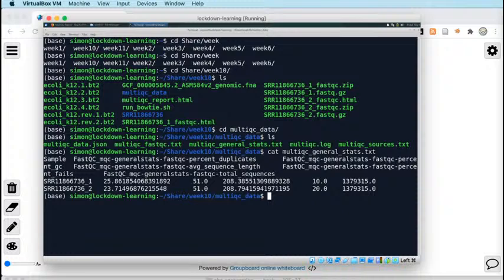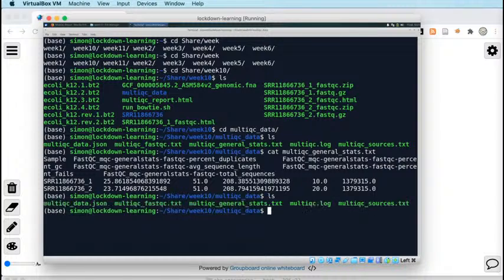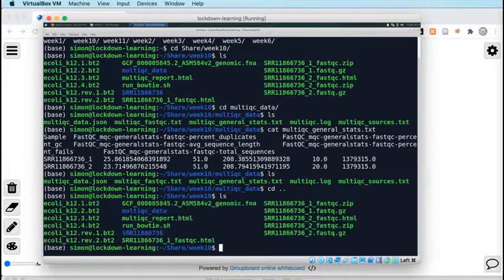Okay, so those are useful statistics for us for estimating our value of k. Our reads are on average around 208 bases long, and there's 1,379,315 of them. It would also be useful to know exactly how long the E. coli reference genome is. That's a useful thing to know as well. I know it's about 4.5 megabases.